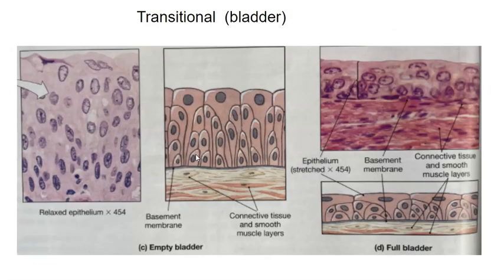Now let's look at transitional epithelium. This is a special epithelium, really only found in a couple of places. This looks a lot like stratified squamous epithelium, so it can be confusing. See, there's the appearance of strata, but if you look more carefully, actually all the cells are attached to the basement membrane. That's why it's called pseudo-stratified, not really stratified. And the best way to tell, I think, is looking at this apical surface. They're not flat like squamous, they're more like balloon or bubble-like.